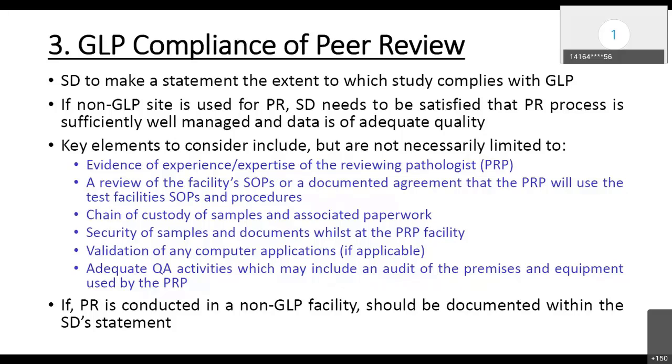And in case any computer system is used for data capturing, like currently Provantis, IBM, PDAS, there are several other software solutions available for capturing the histopathological findings using a computer application.